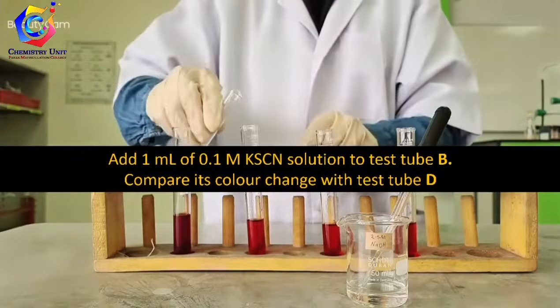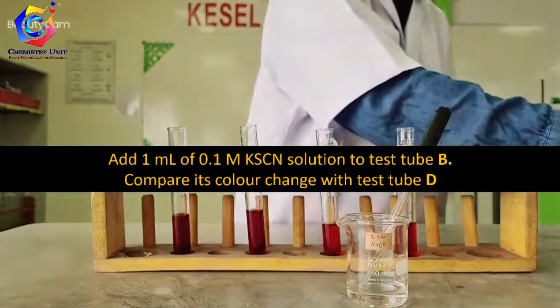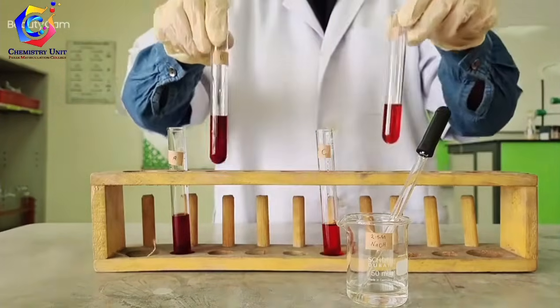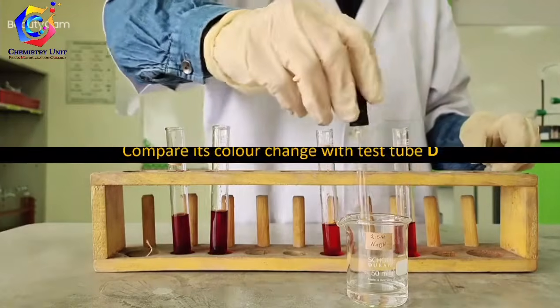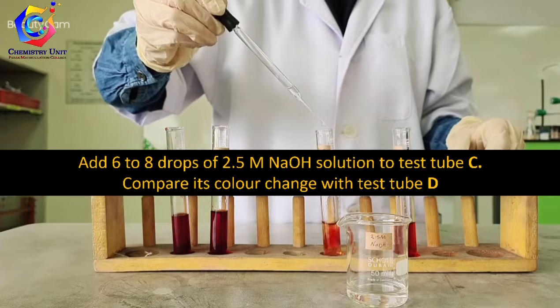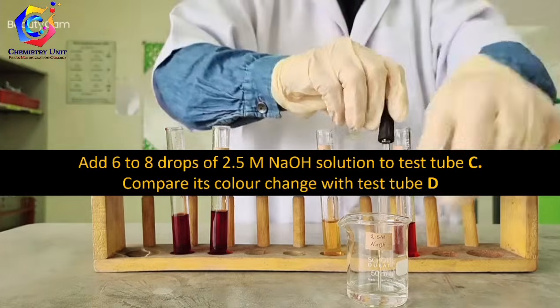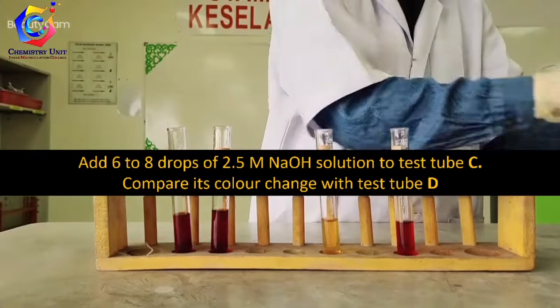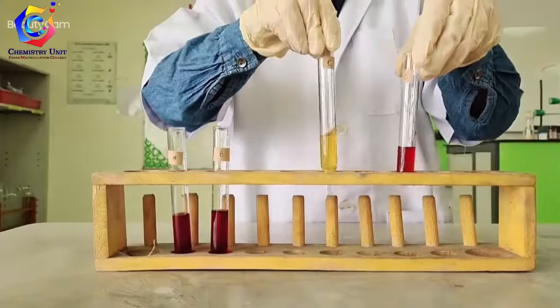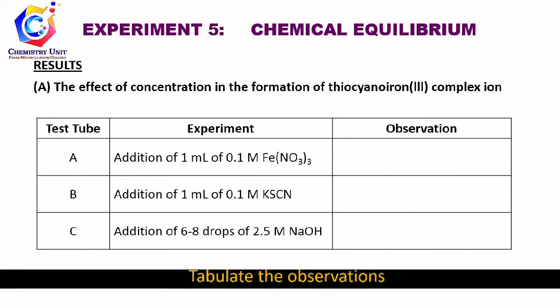Next, add 1 ml of 0.1 molar potassium thiocyanate solution to test tube B, and then compare the color change to that of test tube D. Add 6 to 8 drops of 2.5 molar NaOH solution to test tube C, and compare the color change to that of test tube D. Now, you can tabulate the observations.